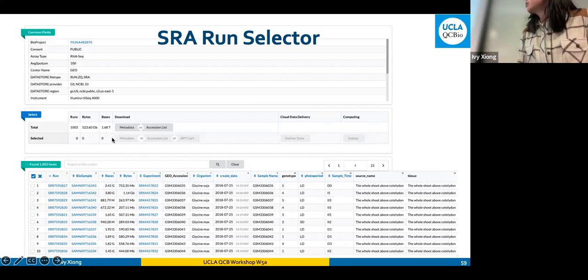But you don't need to download all of them. If you're only interested in some samples, there's a toggle switch here to select a subset of the samples. There are a lot of big tables containing information about individual samples. For example, which species are they sampled for? Is it the lab-grown version or the wild type of soybean?